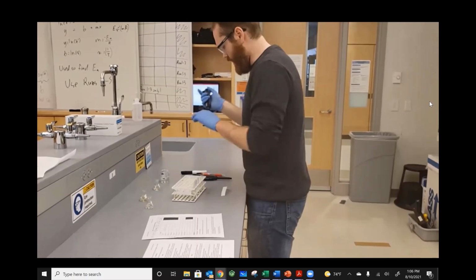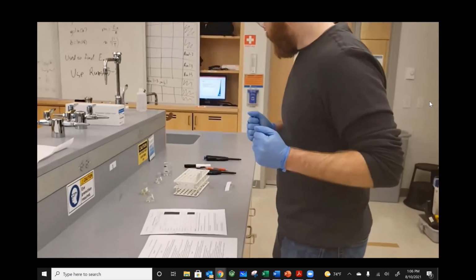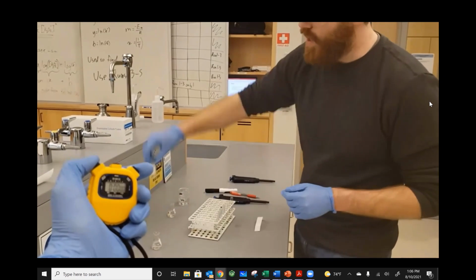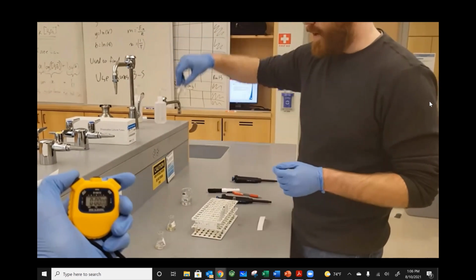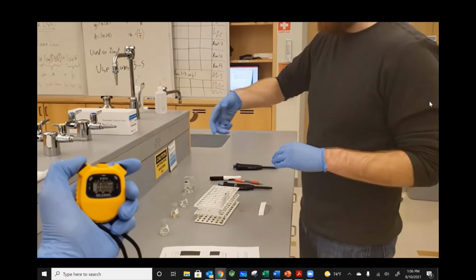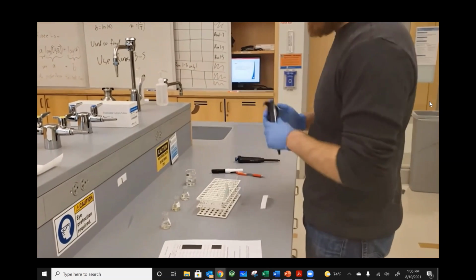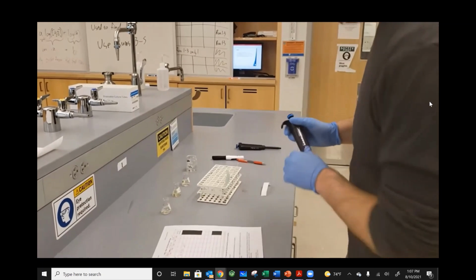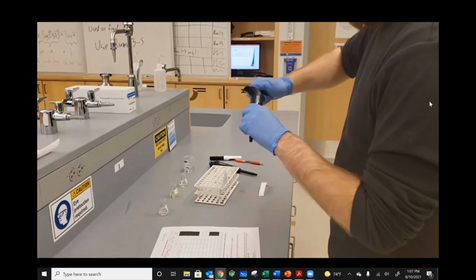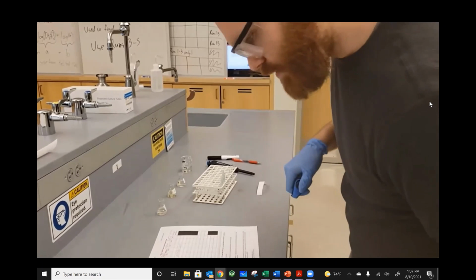Now I'm going to need the help of my camera worker to start the timer when I add my hydroiodic acid and my sulfur-containing compound, because the reaction begins to happen fast. Now, while this reaction is happening, I want to be agitating my test tube so that all of the components are mixing thoroughly and are given the proper chance to interact with one another. I need 1,000 microliters of hydroiodic acid. I have that set. And I need 200 microliters of my sulfur compound. Is that thiosulfate? Correct.